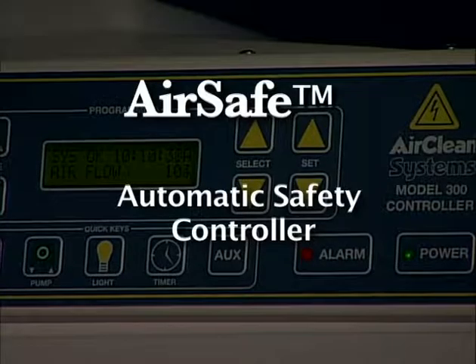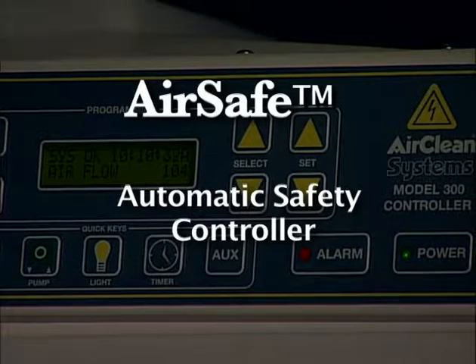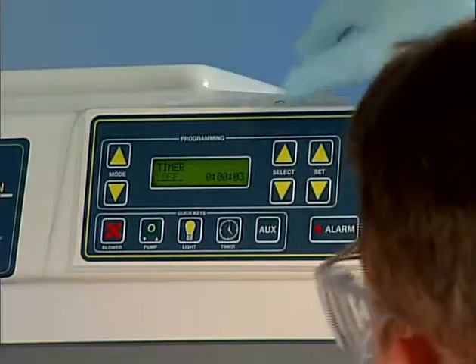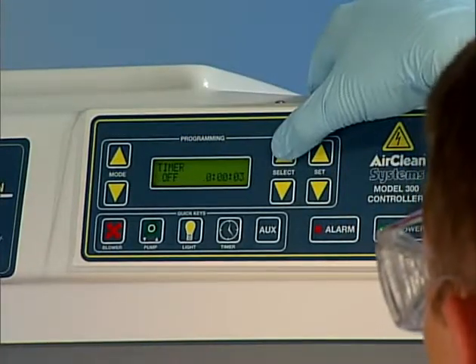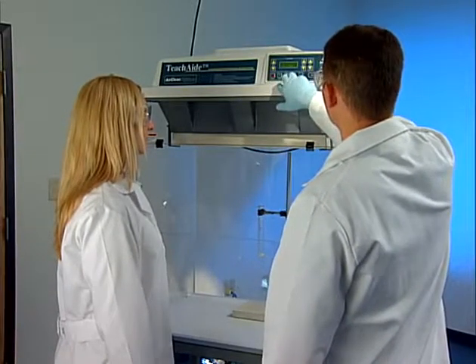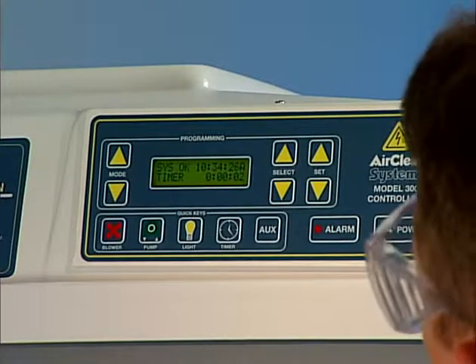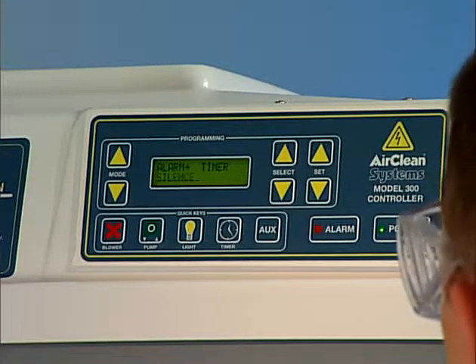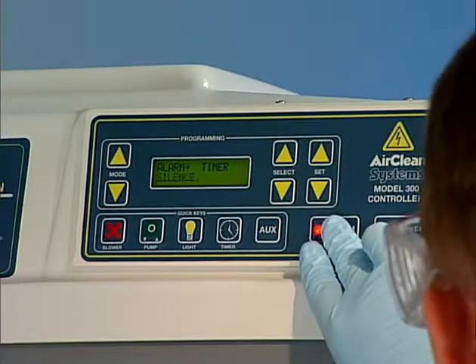AirSafe automatic safety controller is standard on each TeachAid ductless classroom demonstration workstation. AirSafe, the ultimate safety device, protects both the educator and the student from exposure to hazardous chemicals and particulate. AirSafe constantly monitors the airflow and filter condition on each TeachAid ductless classroom demonstration workstation.